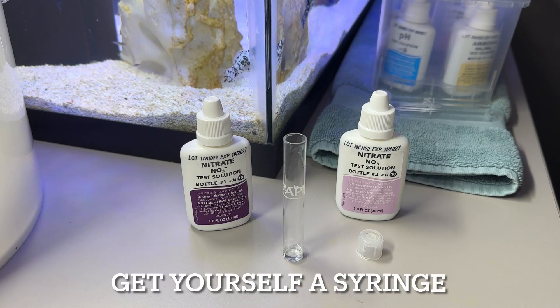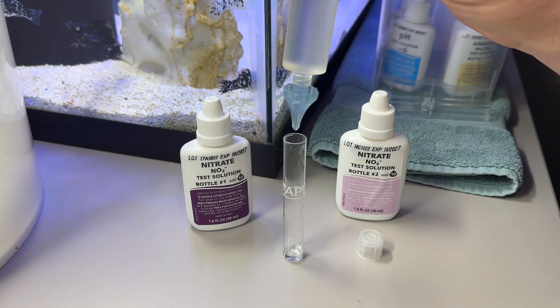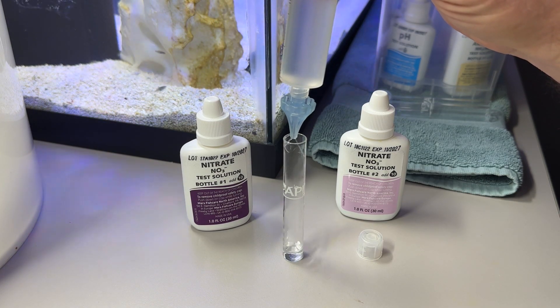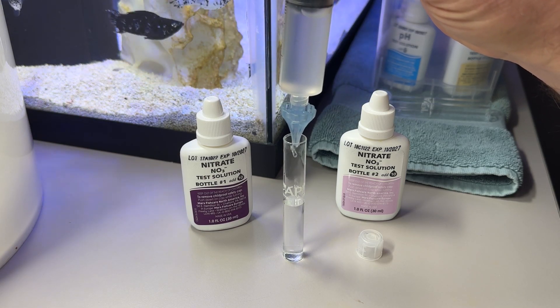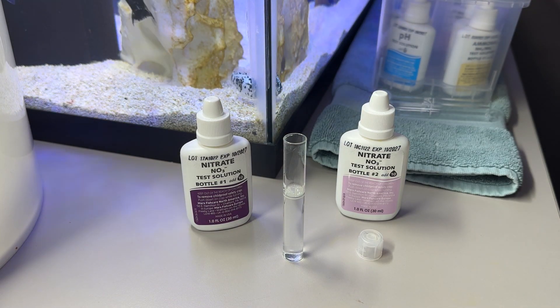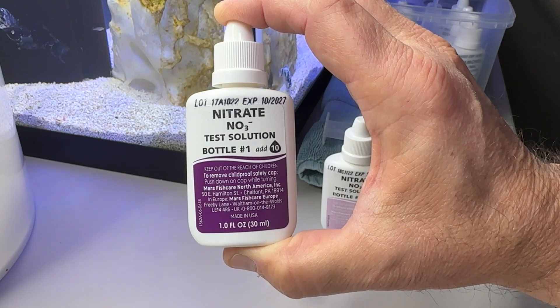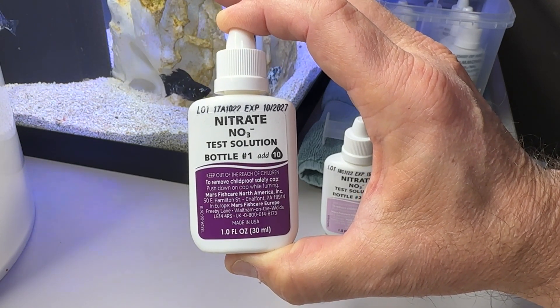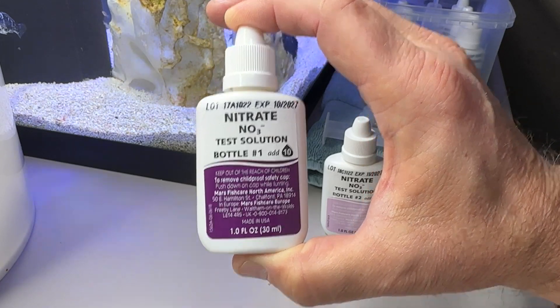Using the syringe that does not come with the test kit — which I showed you in the last video — makes it a lot easier. We're going to fill the test tube to the five milliliter line. Using nitrate test solution bottle number one, we're going to add ten drops. I recommend shaking it for five seconds.